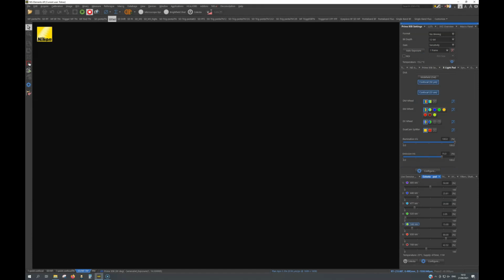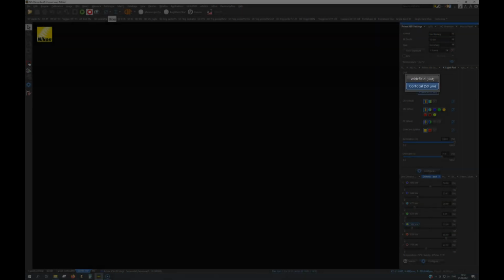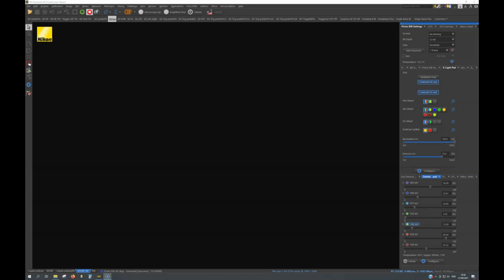The camera sensor has 1608 pixels times 1608 pixels, and for the first acquisition we will use the full sensor. If we had used the region of interest to define a smaller area of the sensor, it would lead to higher frame rates. We will test this later. The microscope is in the confocal mode, and the pinhole size of the spinning disk we are using is 50 micrometers. Now we will acquire a fast time-lapse of 50 images in the same manner as we did for the resonance scanner.